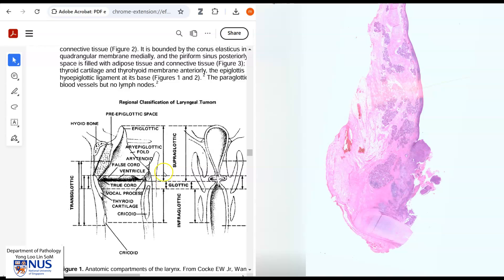And here we can see a diagram of the laryngeal structures pretty much in the same view or same plane as we see on histology. So this is the epiglottis, as we see here, and this is the thyroid cartilage, as we see here, just starting to come up. And we can see that the tumor in our case is involving supraglottic and the glottic region — the false vocal cord or the supraglottic structures and the true vocal cord or the glottis.